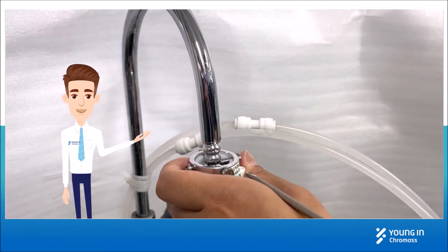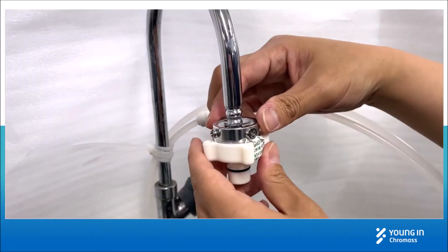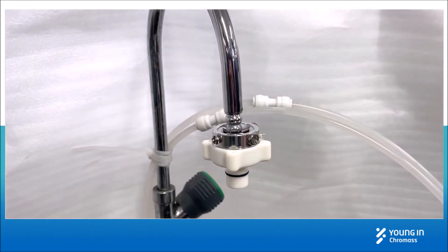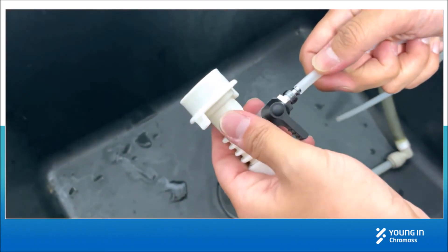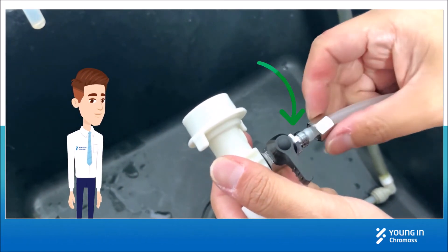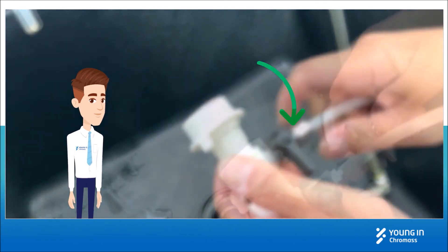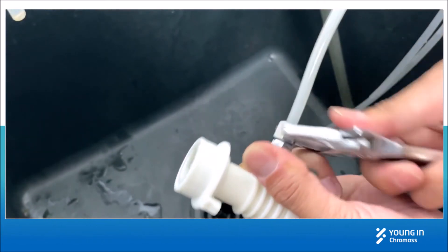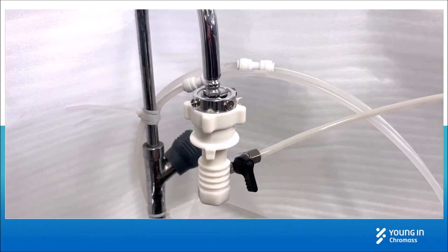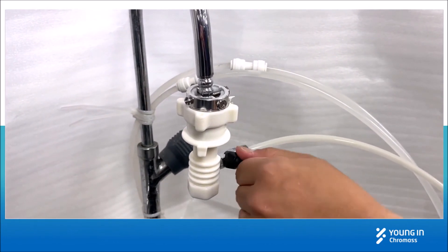Install the upper part of the tap water adapter to the tap. Install the tubing from the inlet port to the outlet of the tap water adapter. Pull down the lower part of the adapter and clip it to fix. Open the nozzle to provide feed water.